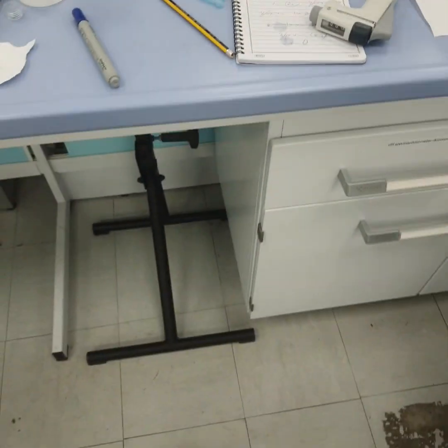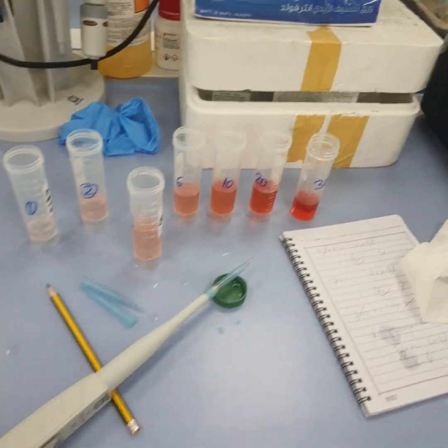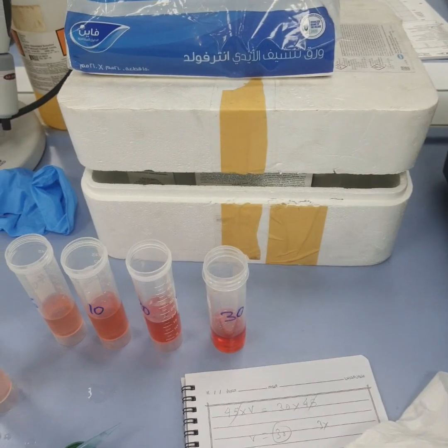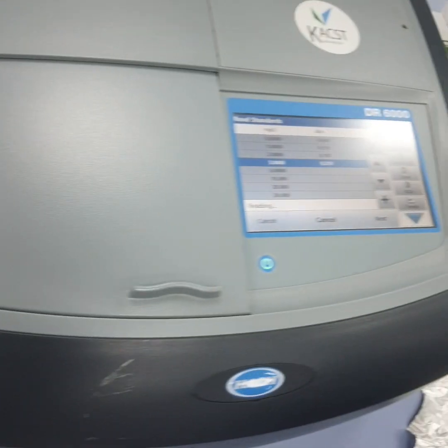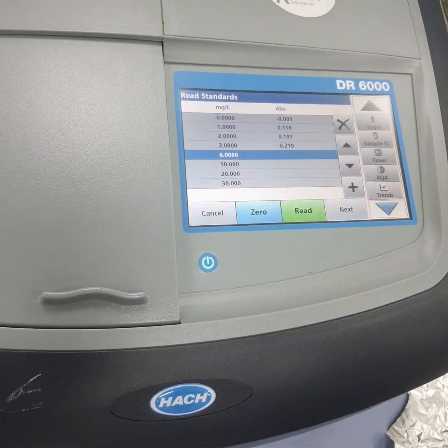We can discard some points later on. So we are testing again 2, right? So this is 3. Again we will check. Okay, so it's not changing. No, let's try 6 ppm.